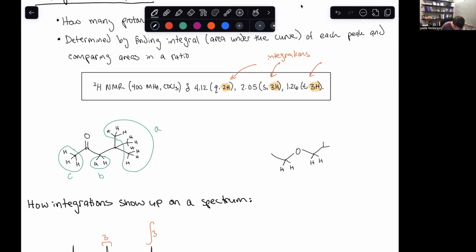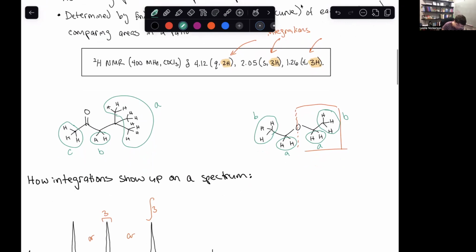If we look at this example, this is one where we do have a plane of symmetry right here. Okay, so we're looking at the same equivalent proton type situation here. And keeping in mind that if I've got this as one environment, I have a mirrored environment over here. So we're looking at A over there. I have this methyl, and all 3 of those H's are going to be the same. And those are both going to be the same environment as well.